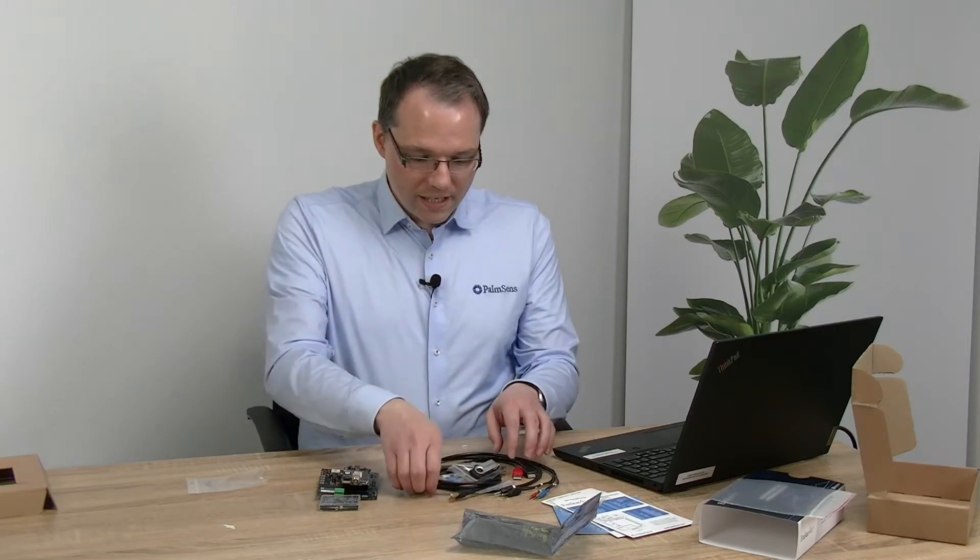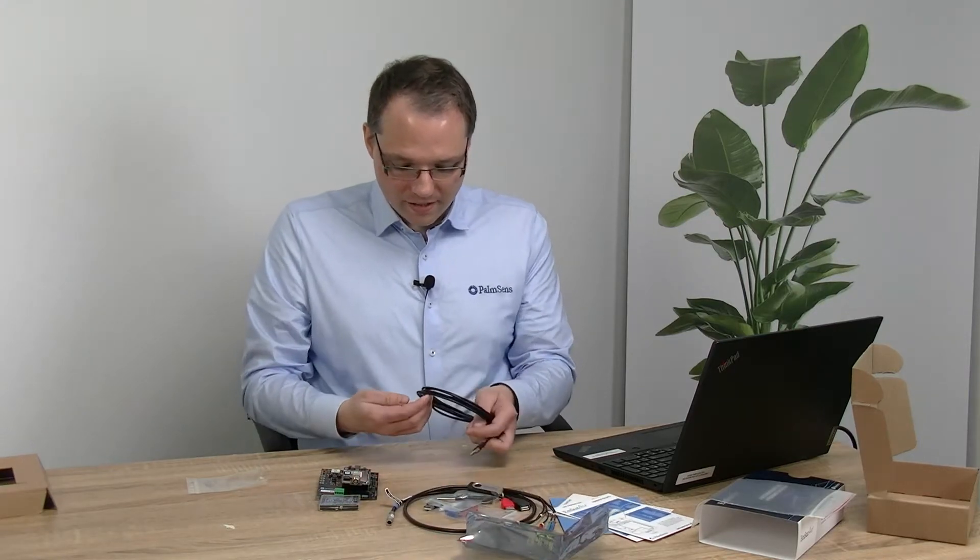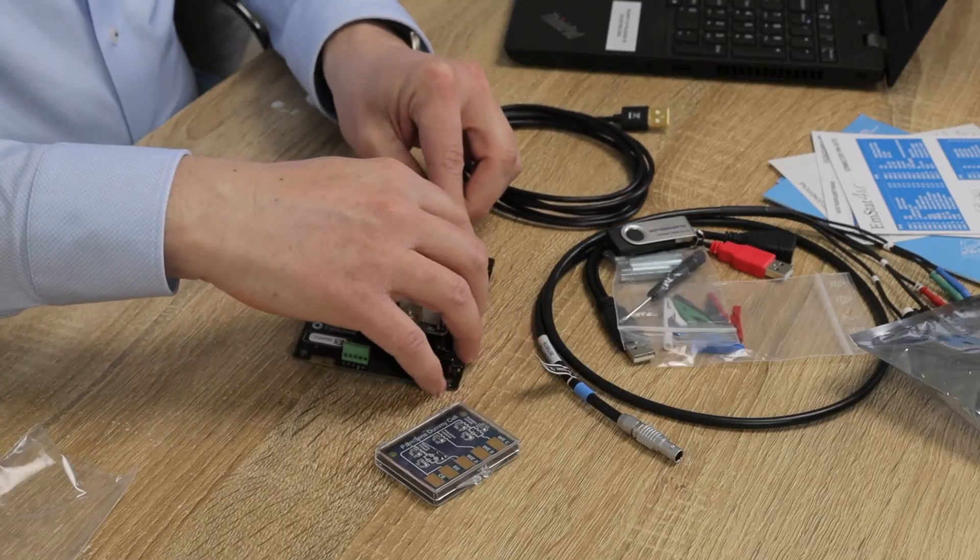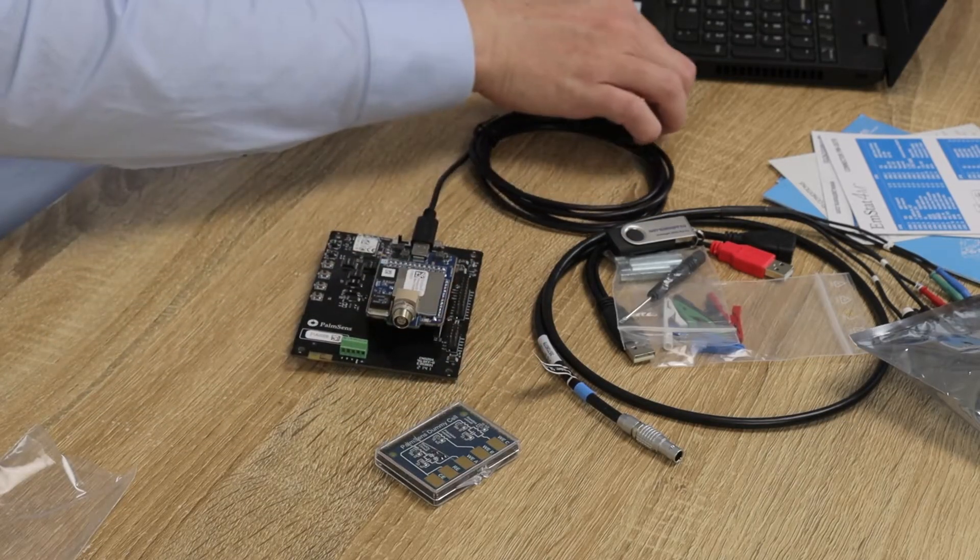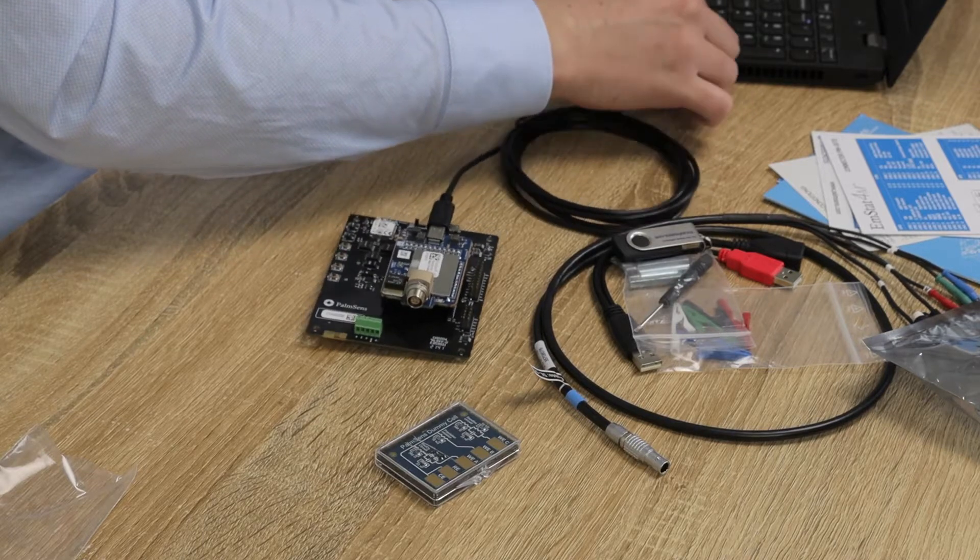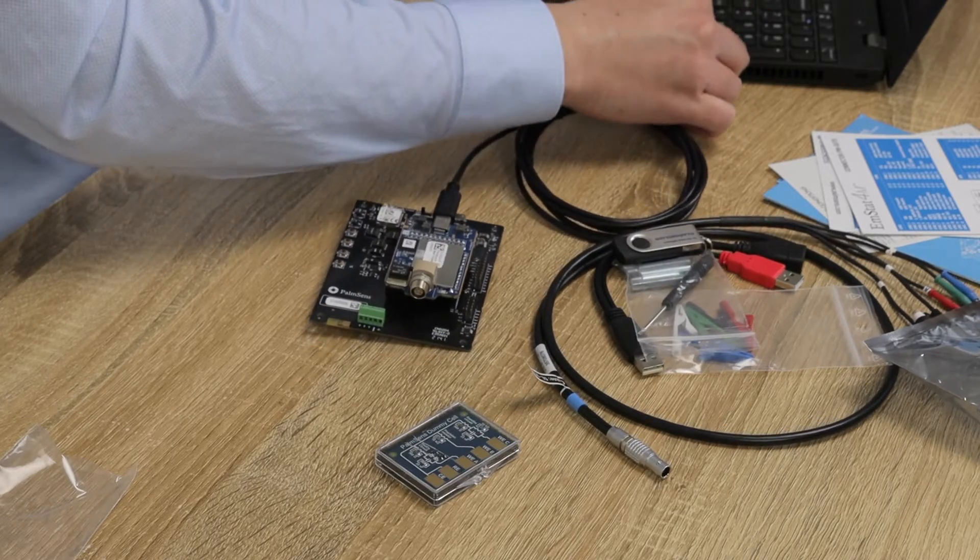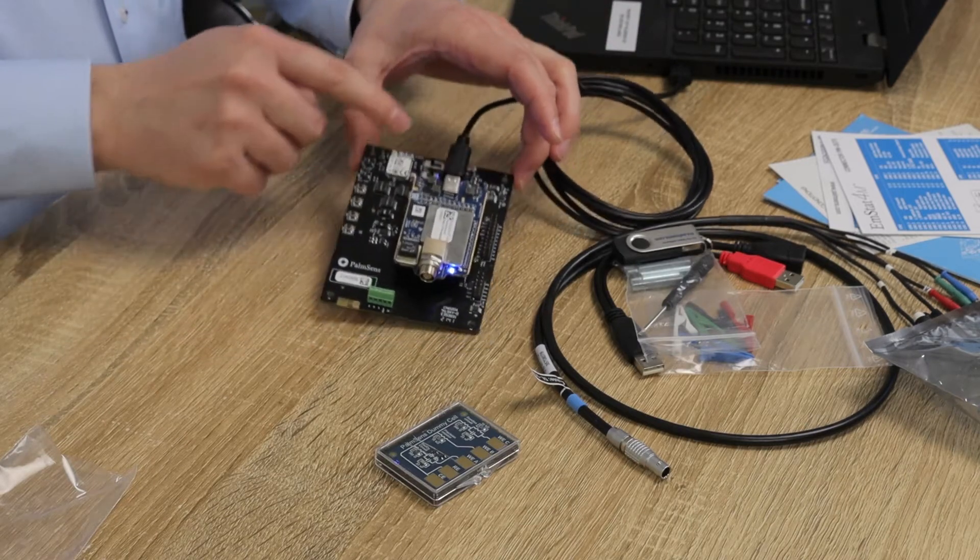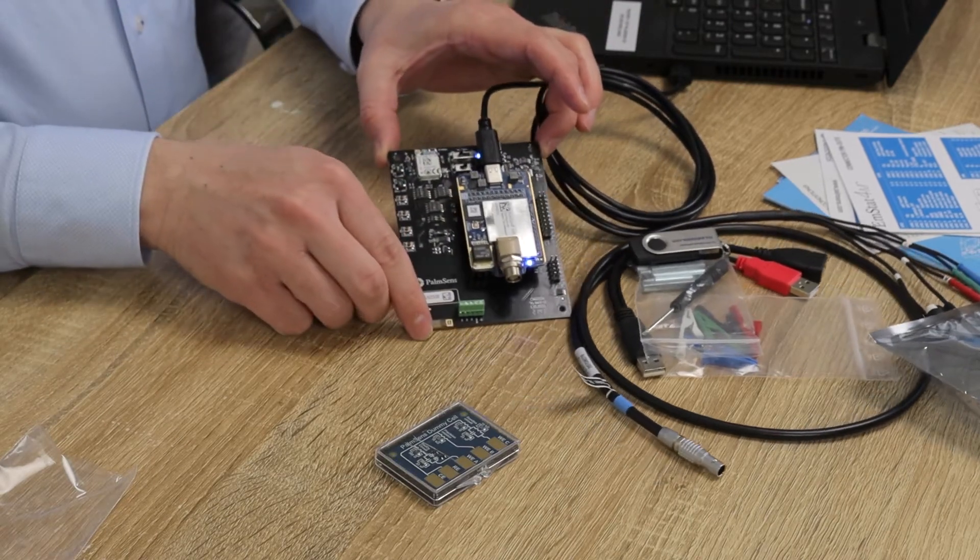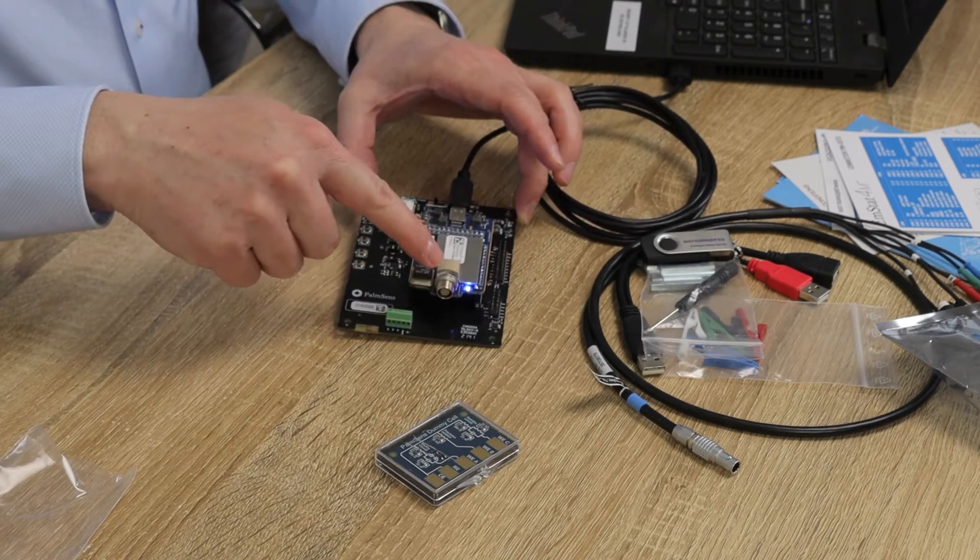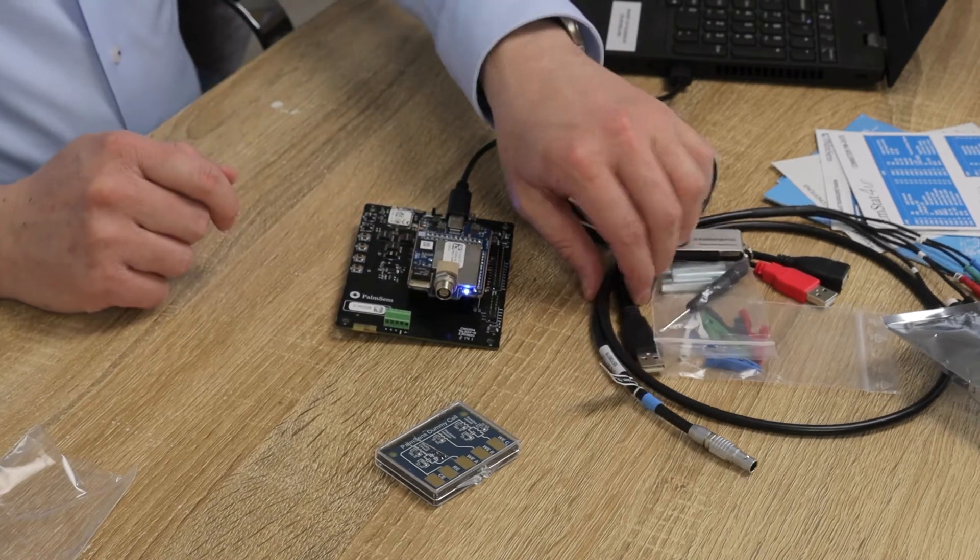Okay, so first let's connect the potentiostat. For that we have here this USB cable. Let's just connect the board and I connect it to my computer. There we go. So you can already see that the board is illuminating and the potentiostat module.